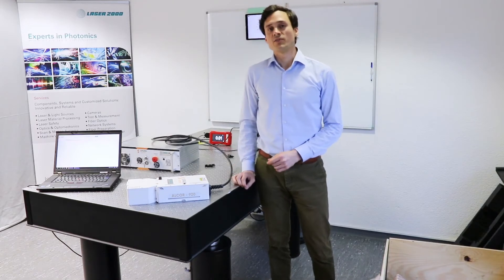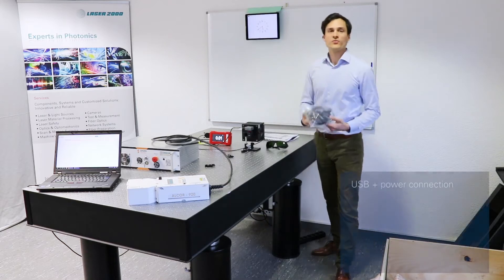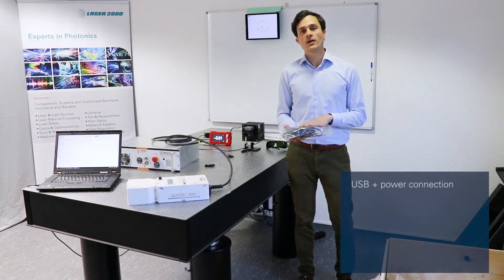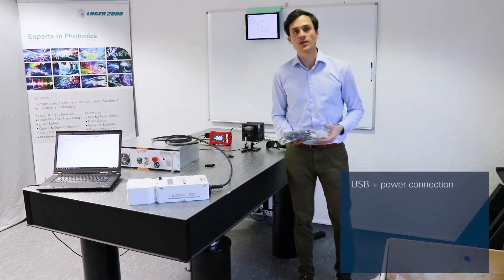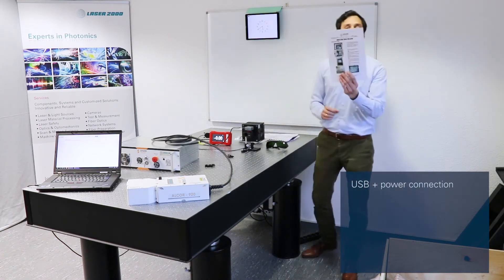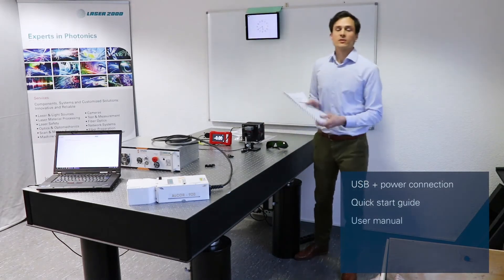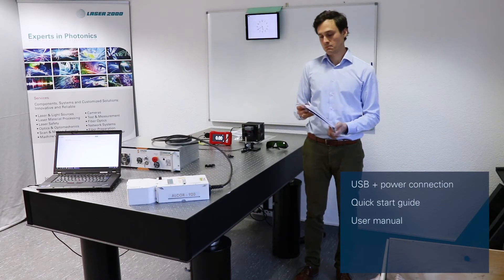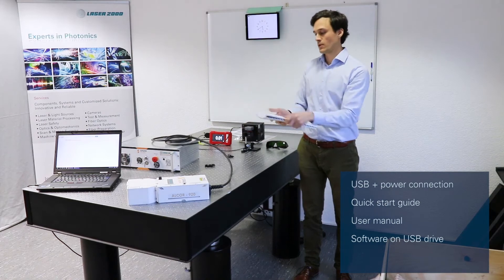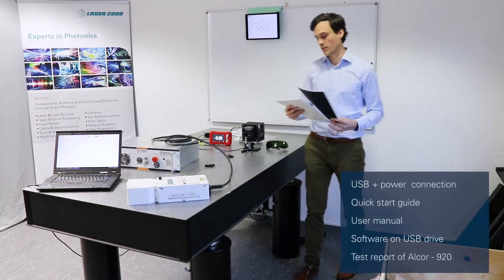Now that everything is on the table, I'll show you what was inside the box. First, we have some cables for the connection of the laser — only a USB cable and the power cable, nothing else is needed. Then we have a quick start guide, and of course the user's manual with the software on a USB stick, and also some test report of the laser.